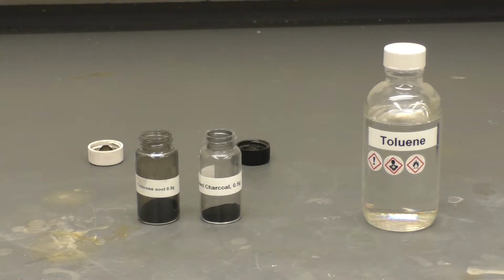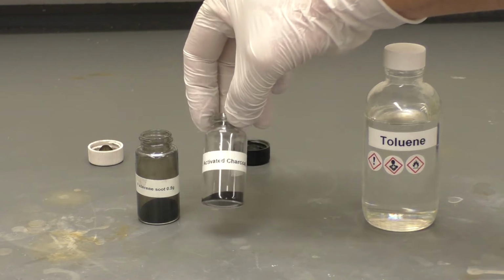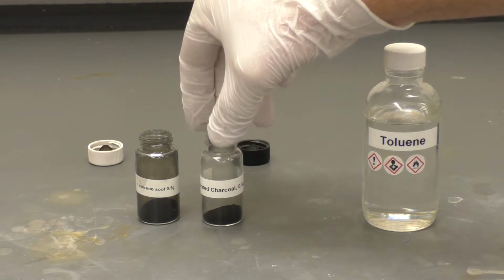It's called carbon black. And the chains of carbon atoms, the bonding between the carbon atoms in just charcoal or soot from a candle or a flame is just really random. And so there's no regularity. They're all a variety of lengths and things like that. And so that's what's in the vial over here on the right. We have 1/2 gram of activated charcoal in there.